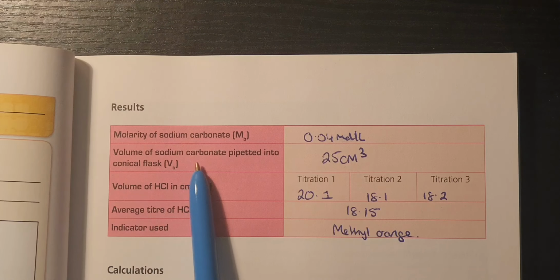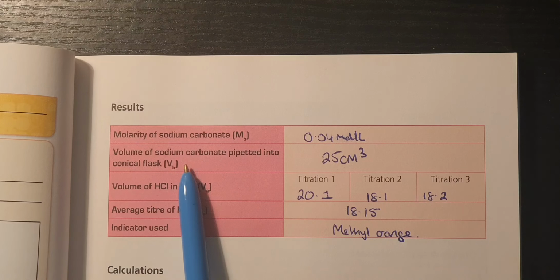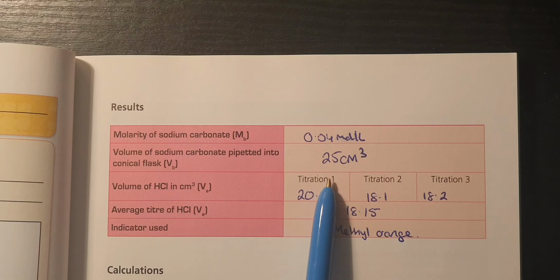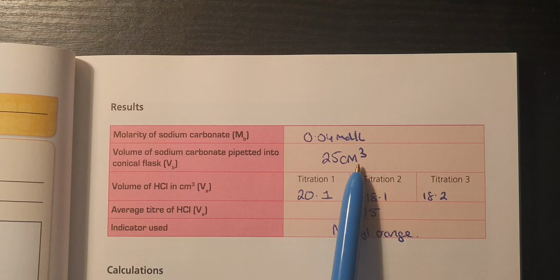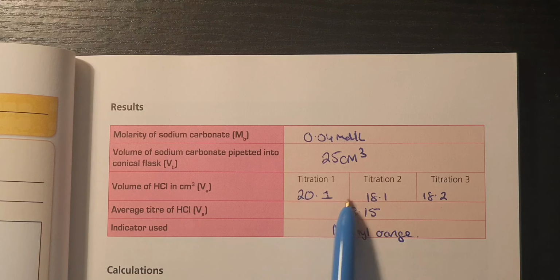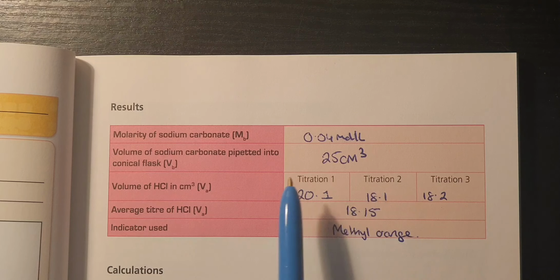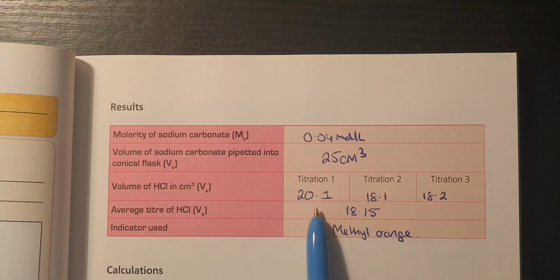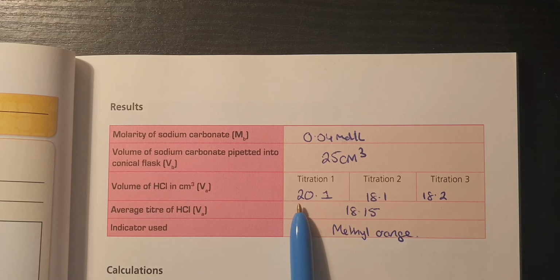The volume of the sodium carbonate pipetted into the conical flask, you should have used a pipette for that, and we have 25 centimeters cubed pipettes in the lab, so that's going to be 25 centimeters cubed. Then you should have produced 3 different titrations, and hopefully 2 of the titrations should be in agreement of around 0.1. So you can see in the first titration here they overshot it. That's going to be their rough titration.